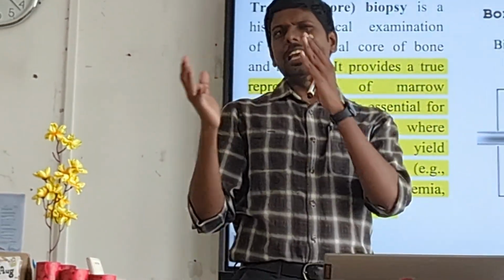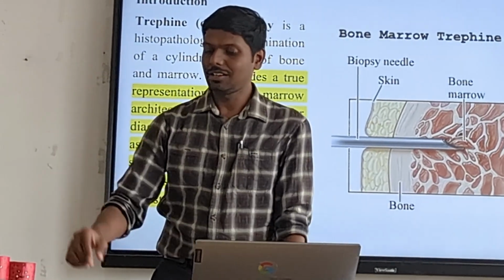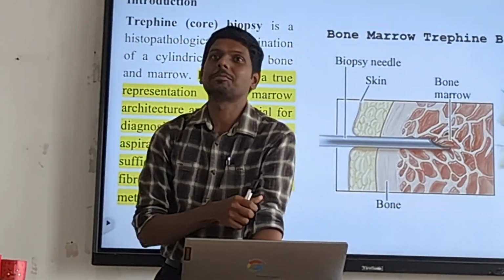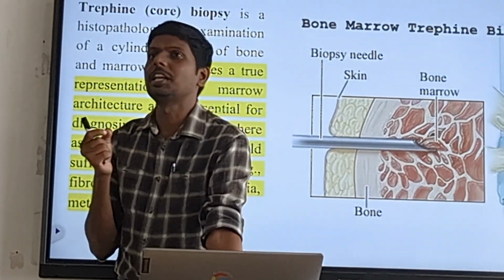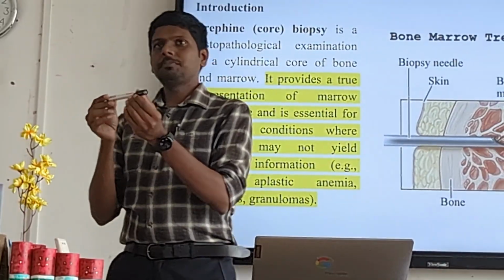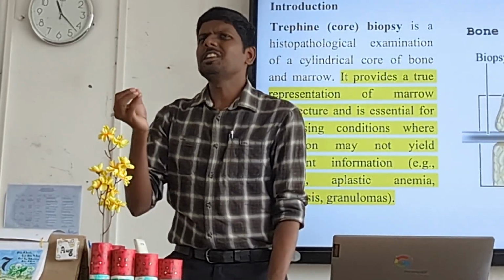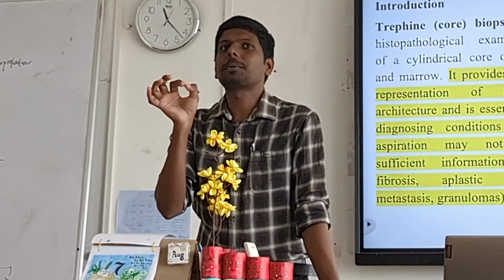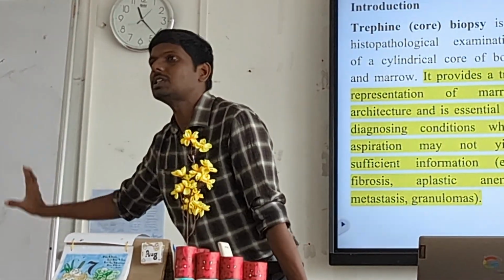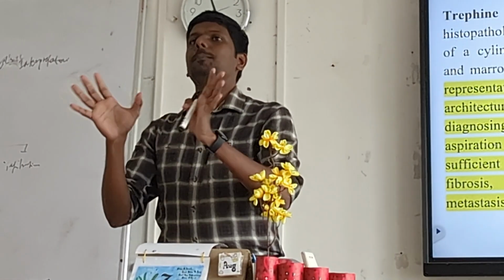Right? Now listen. I know it will be slightly boring, but I don't make it boring. I know because Manorajans are already teaching this subject. But anyway, let me define my perspective of tissue processing. Before this, I just want to ask, what is the primary purpose of tissue processing? Can you tell? Why do we need to process the sample?